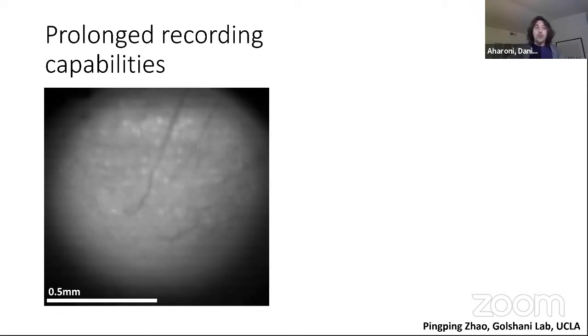So one of those is to take this design and turn it into a dual color Miniscope. All the optics in the version 4 are achromatic, which is an issue if you were using a large objective GRIN lens. GRIN lenses have a ton of chromatic aberration, so we have removed that with achromatic lenses, and it's effectively the exact same version 4 Miniscope, but with a different circuit board that provides dual excitation through the system.